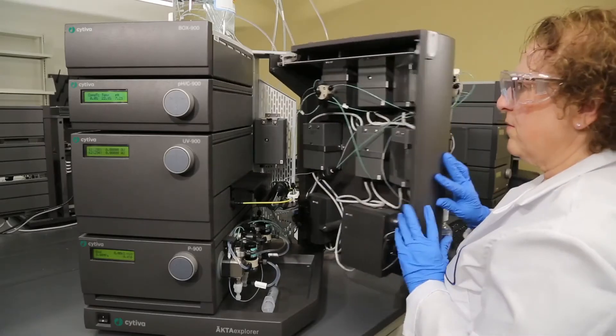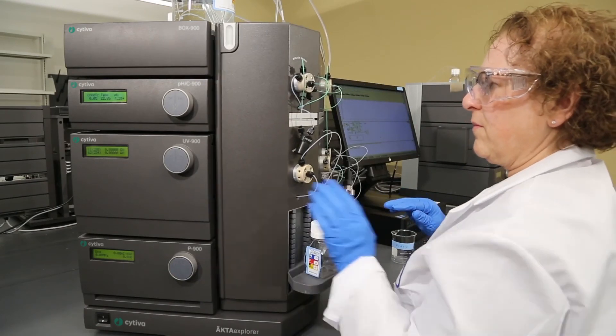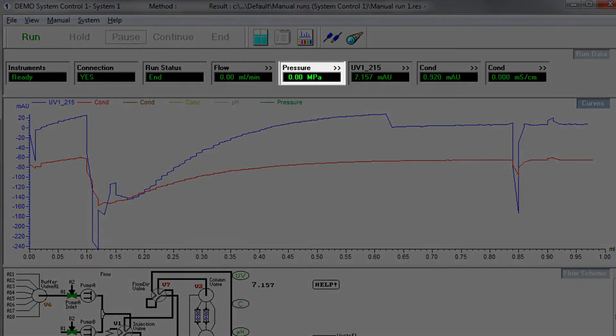In Unicorn, verify the pressure is reading zero in the run data at the top of the window. The pressure offset calibration is now complete and the ECTA is ready for use.